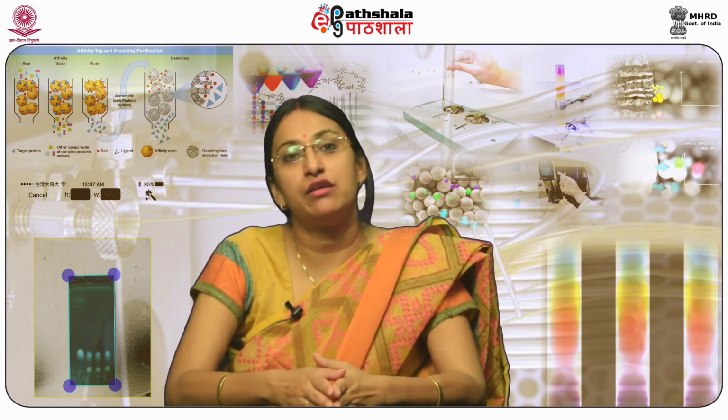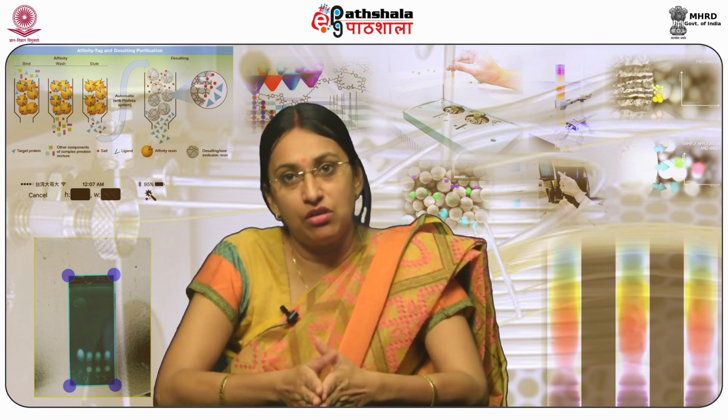If buffer solutions are used as mobile phases, thorough washing should be done using water to prevent any deposition of crystalline compounds. While performing gradient elution, the changeover of mobile phase polarity should be gradual and washing should be given using a solvent of intermediate polarity. Finally, the delivery of mobile phase into the column should be non-turbulent.